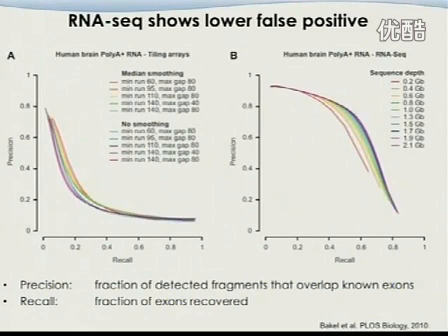Oh, this is the analysis methods. They compare them, so they can do a certain level of normalization, whether they do RNA or not, but we don't have to get there. This is a different level of analysis. This is a very hard paper to read, actually, published last year in PLOS Biology. They also have a few other papers, but this is a really important figure for you to study. So just take a look at how you would put that into the ENCODE system.